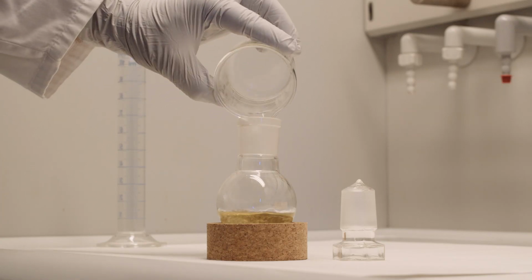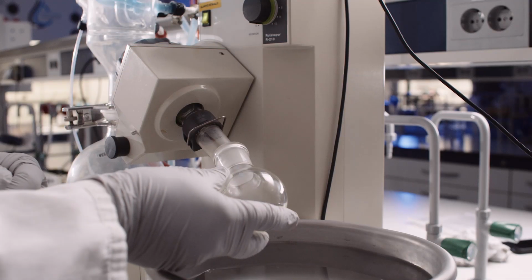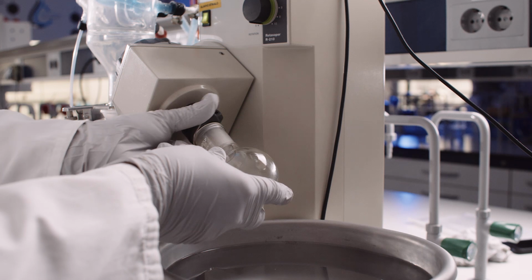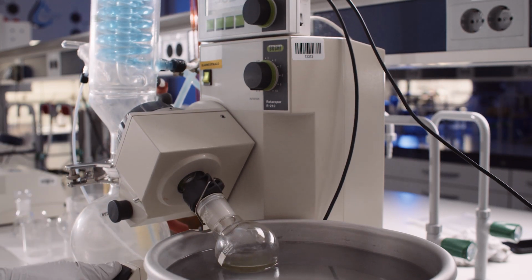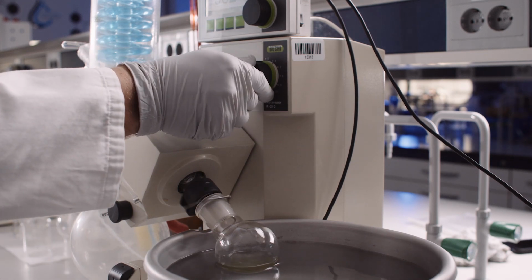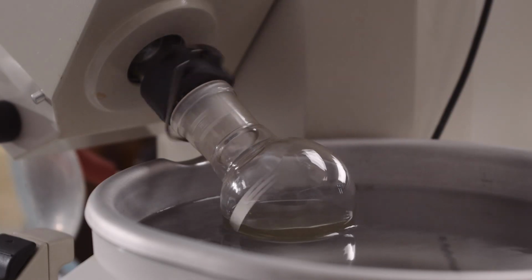When all the mobile phase has passed through the column, place the extract in a ground glass flask and transfer the sample to a rotary evaporator, which evaporates the solvent from the sample using reduced air pressure and elevated temperature. Solvent vapors are condensed using a refrigerator and collected in a separate flask. The procedure allows us to concentrate the sample.